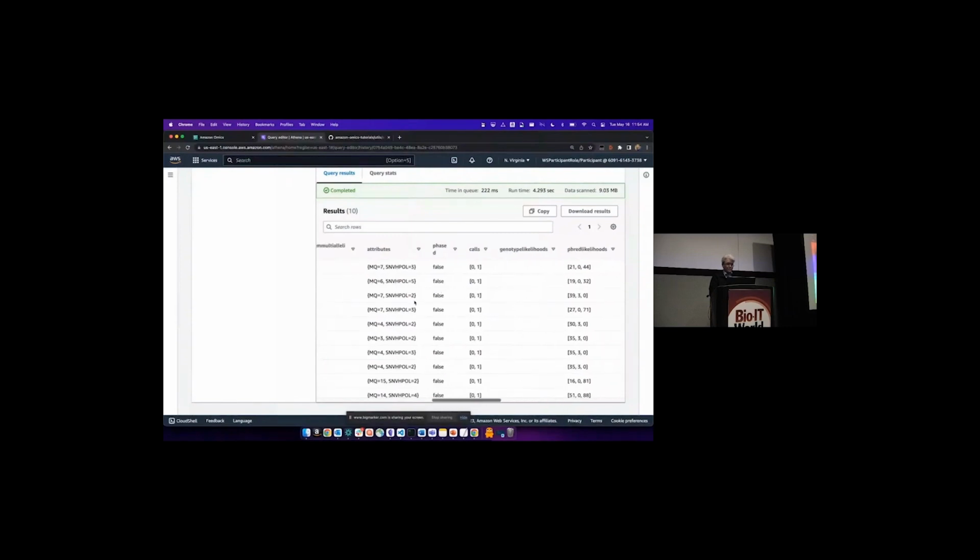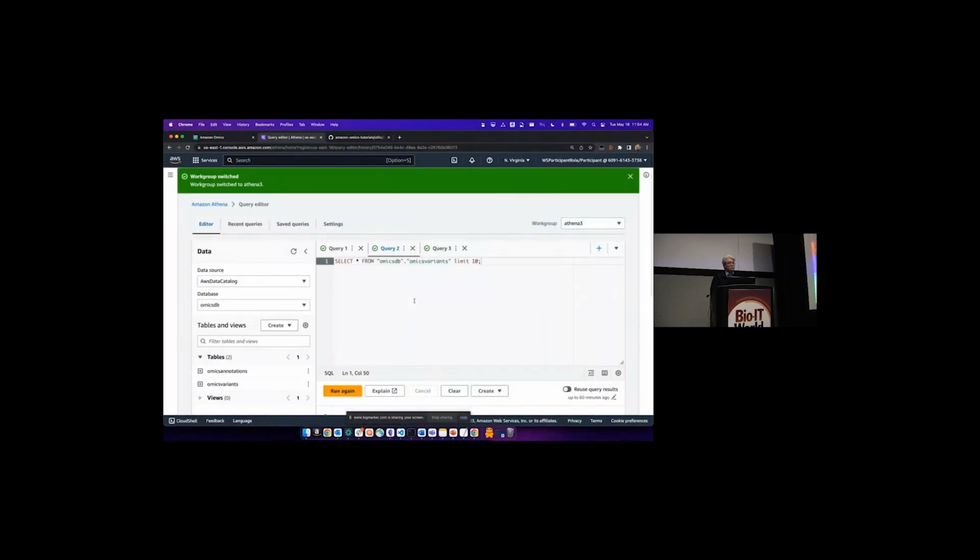Let's say you have something like that. That might be something you can talk to later, right? With querying, like just getting more statistical information out of it.